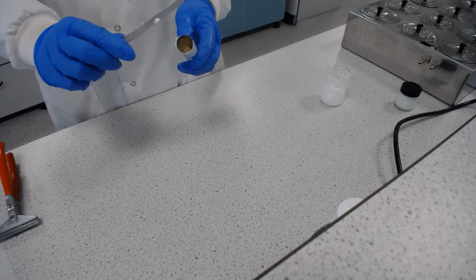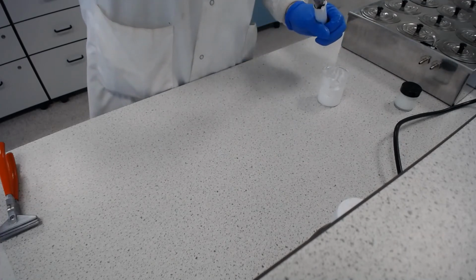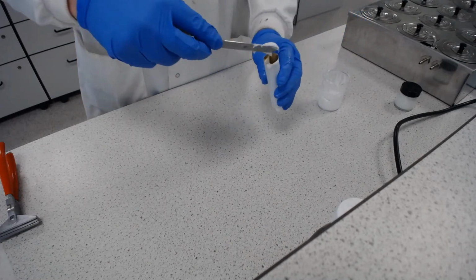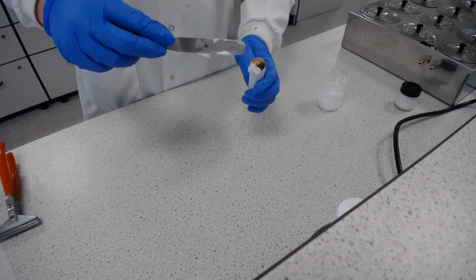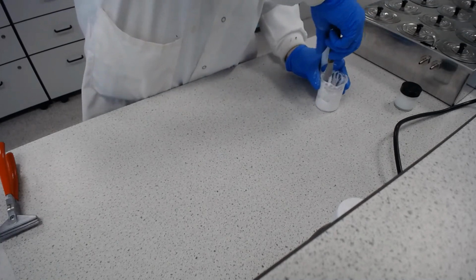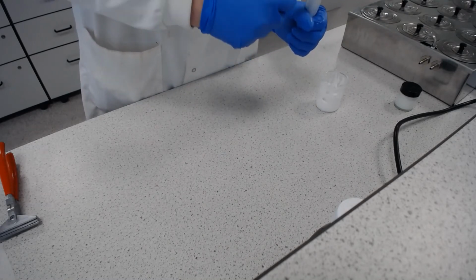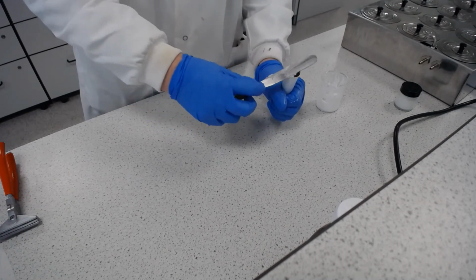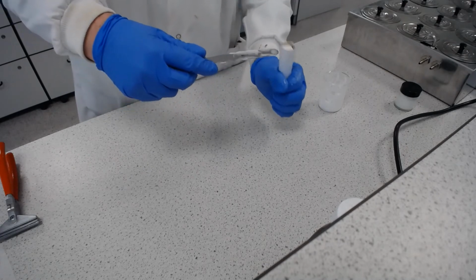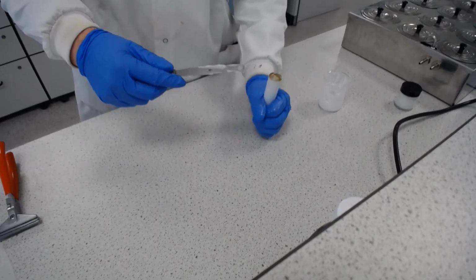This isn't completely full, and so you might want to put a little bit more in, but it can be a bit messy putting the cream in this way. So if you want to put a bit more in, you can do so with the palette knife. But as I said, this is maybe a slightly messier and more wasteful way of getting the cream in the tube.